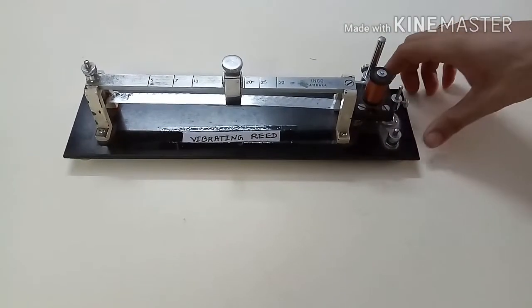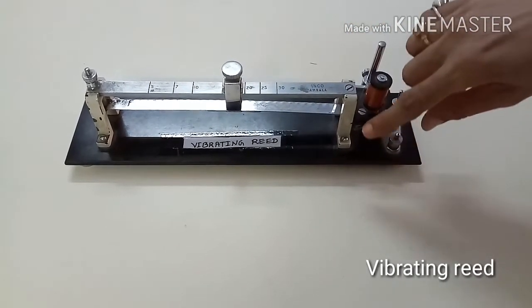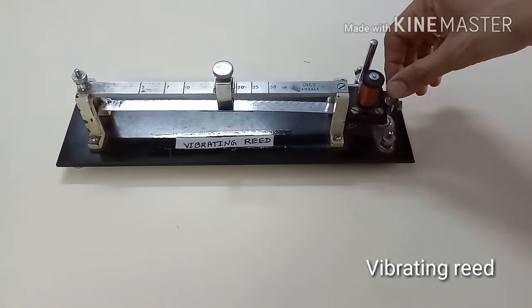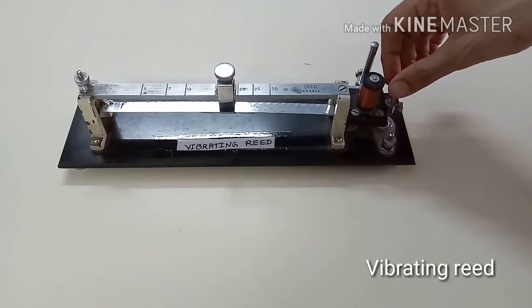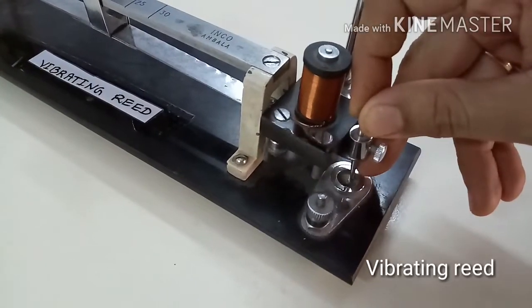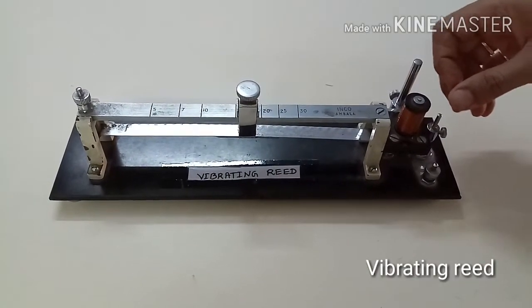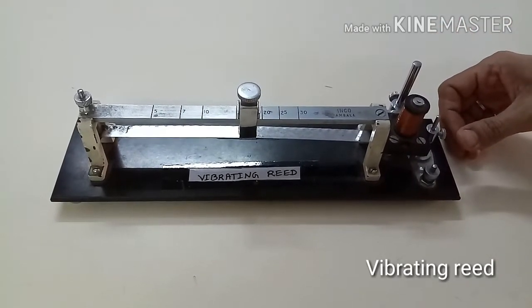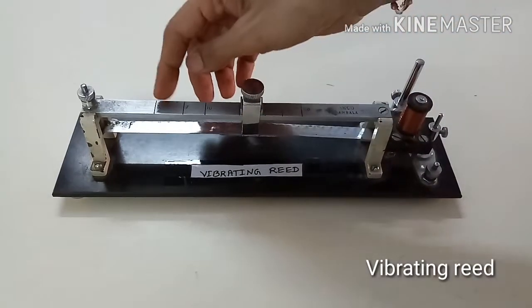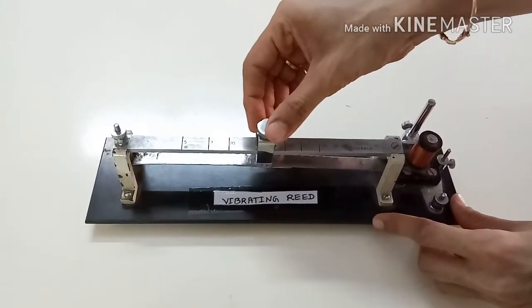Next is Vibrating Reed. It is a metal strip mounted on a stand. The metal contact point dips into the mercury cup, from which a wire is taken to complete the circuit. This is the mercury cup. It is a device to give a desired number of induction shocks depending on the free length of the reed. We can give 5 to 30 stimuli per second, and this way we can change the number of stimuli per second.